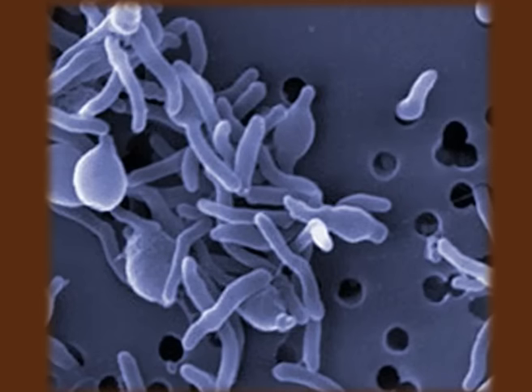Now, what kind of culture medium depends upon the nutritional requirements of the bacteria. Whether we want to grow autotrophs or heterotrophs, the composition or the type of culture medium is designed accordingly. Microbes that grow in or on the culture medium are known as microbial cultures. Most of the microbes are able to grow on this synthetic medium, however, there are certain groups of microbes which fail to grow in lab conditions.